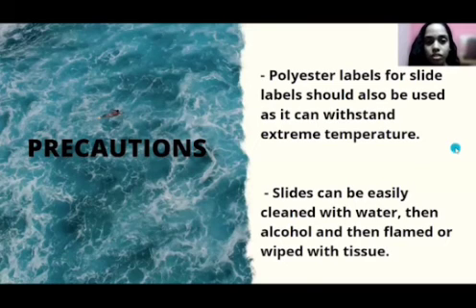Next, we'll go to the precautions. Polyester labels should be used for slide labels as they can withstand extreme temperatures. So that's all from me.